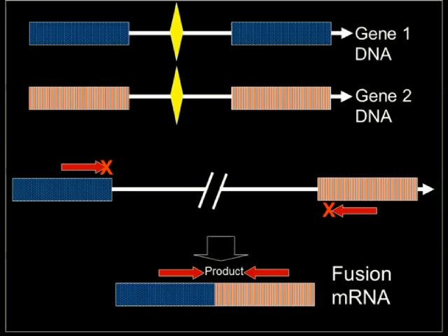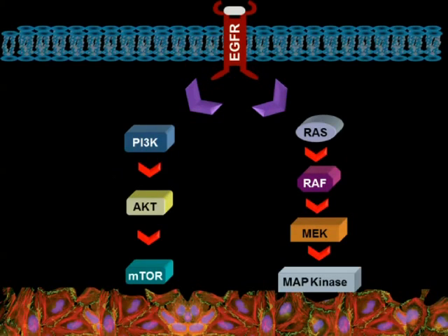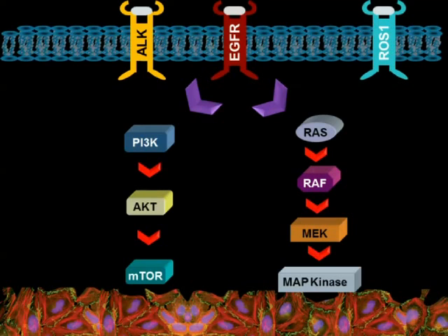And when you amplified both, preferably in separate tubes, but possibly multiplexed if you design them correctly, then you would get two different products if you have a mutant and a normal present. So you would have one product amplified from the normal primer, and you'd have one product amplified from the mutant primer, and you'd see two different products and know that one mutant and one wild type were both present. And that's also a very straightforward, simple approach.